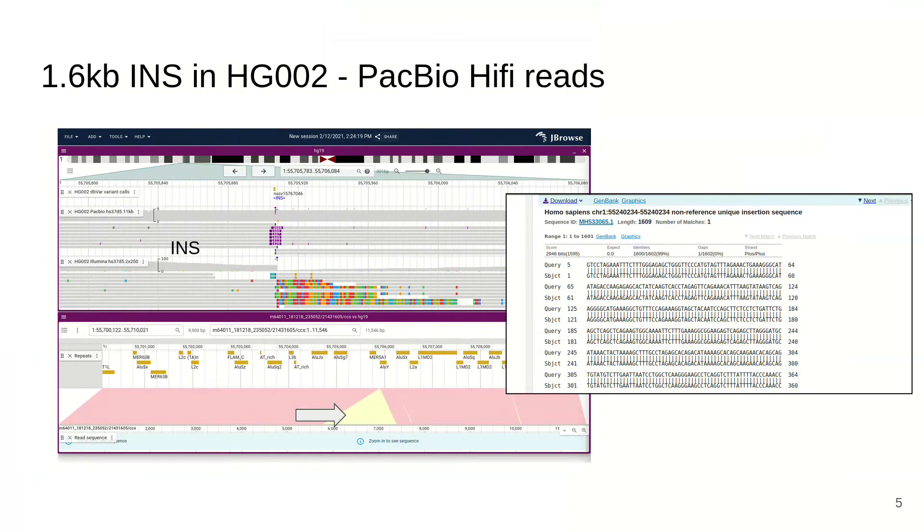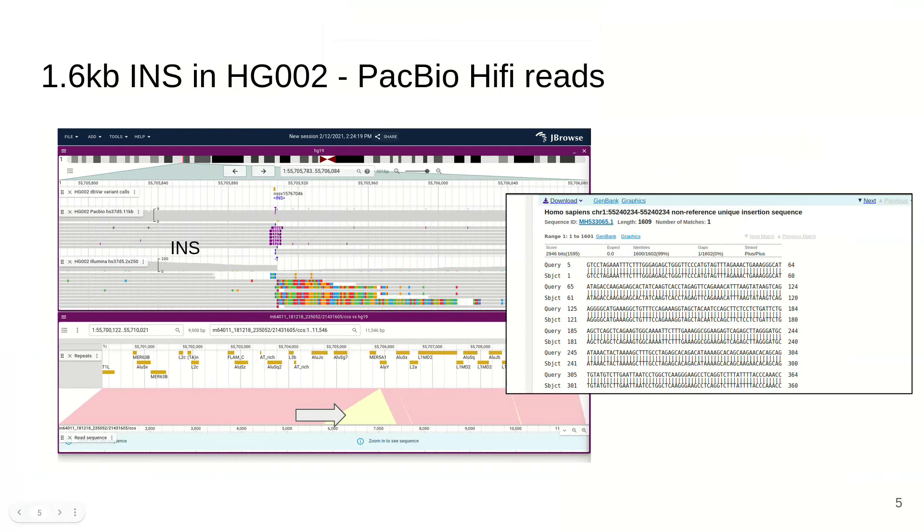We can also explore insertions in detail. These are PacBio HiFi reads from the Genome in a Bottle project with an approximately 1600 base pair insertion. One interesting feature is you can right click one of these reads and it will pop open a read versus reference view. The read sequence is on the bottom and the reference genome is on the top. This yellow triangle shows the extra bases that are on that read. You can actually click and drag to select that sequence and run it against BLAST. In this case it comes up with a unique insertion sequence, but maybe in your dataset it would come up with a transposon sequence or something else of interest.